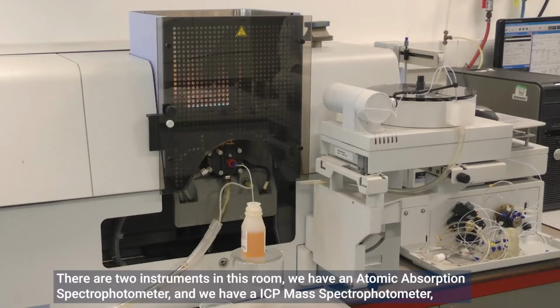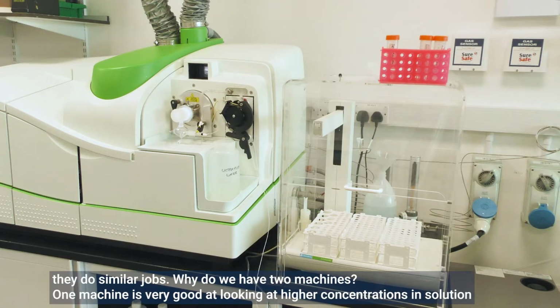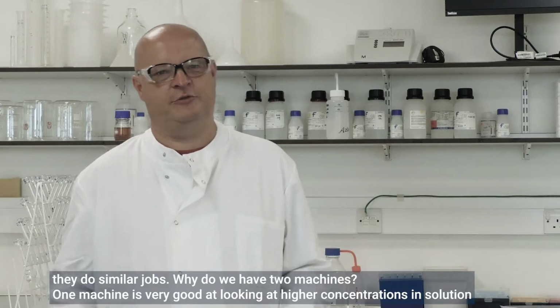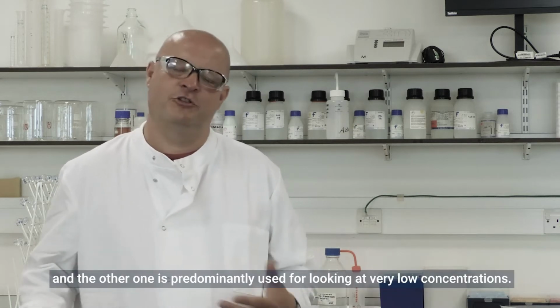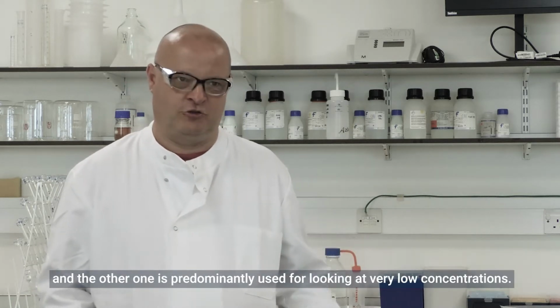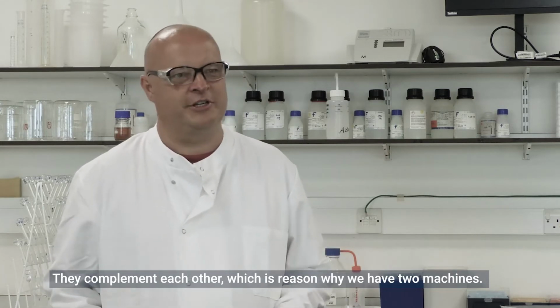There are two instruments in this room. We have an atomic absorption spectrophotometer and we have an ICP-MS spec as well. They both do similar jobs. Why do we have two machines? One machine is very good at looking at higher concentrations in solution, and the other one is predominantly used in looking at very low concentrations. So they actually complement each other, which is the reason why we have two machines.